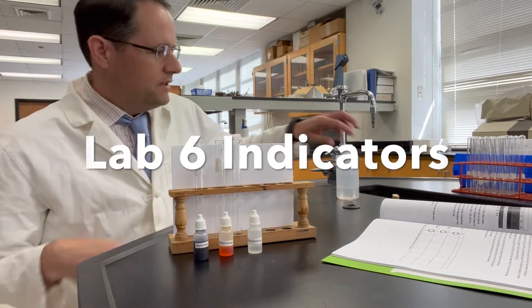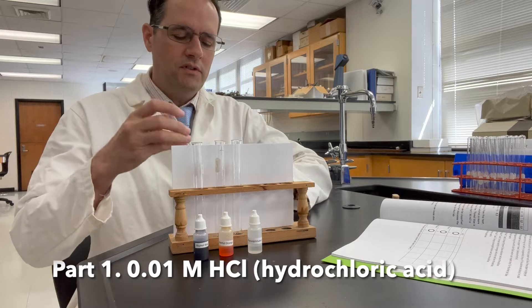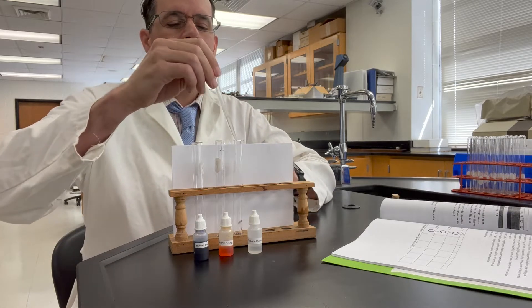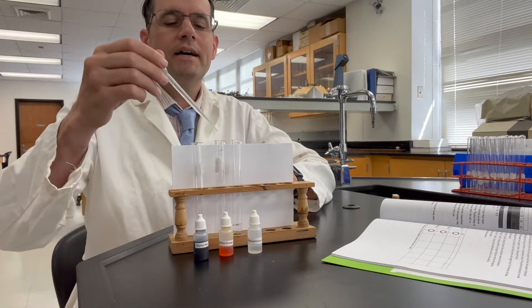This is part one of the indicator lab. Into each of these test tubes I will be placing approximately two milliliters of 0.01 molar hydrochloric acid.